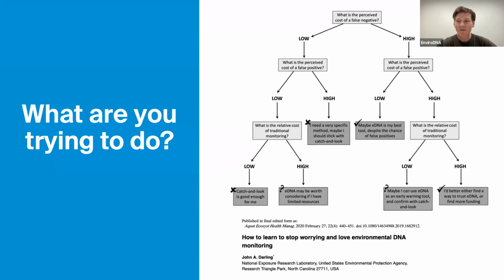So you should always think about this decision tree before you embark on a project, whether that uses eDNA or other methods, and think about the consequences of what detections mean. It may be that eDNA is the only option for you, or it may be that it is one of multiple, or it may be that eDNA is coupled, used as a sort of pre-screen, as it often is now in a biosecurity context, where it is a relatively cheap way of assaying large numbers of species quickly, which can then be followed up with other methods should anything of concern be thrown up.